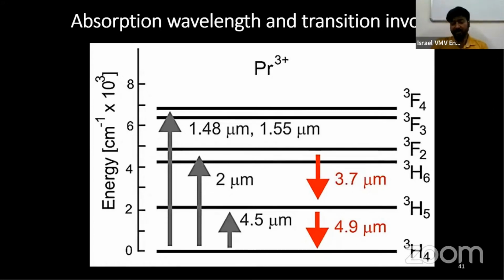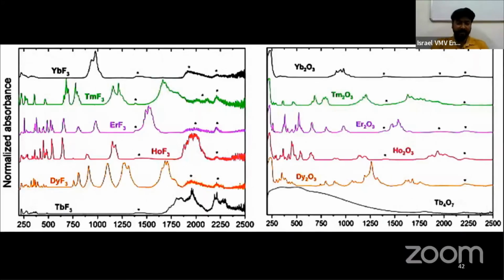They show characteristic absorption. They are especially interesting when they show absorption in the near infrared region. The absorption spectrum of these lanthanide elements is different from the examples we have seen in the earlier discussion, whether organic molecules, organometallic complexes, or metal nanoparticles. See, this is the absorption spectrum of lanthanide oxides and lanthanide fluorides. See how many bands there are? All these arise because of atomic excitations.